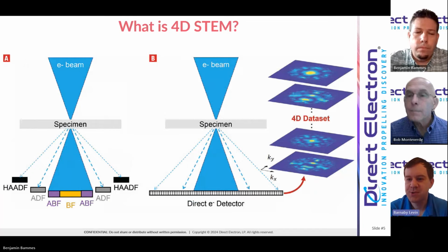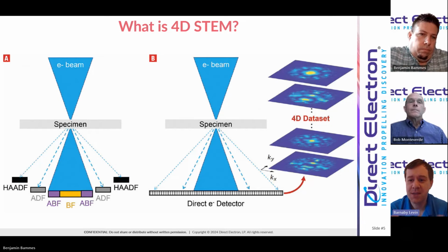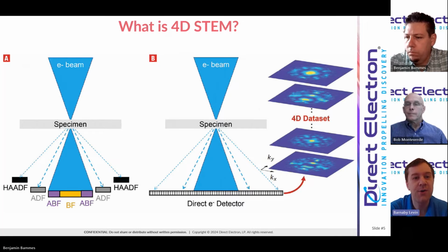So first, I'm just going to give a quick overview of what 4D STEM is. I think most of the people who've joined the webinar probably have some idea already, but I'd like to make sure everybody's on the same page. So what you're seeing here are two diagrams, one showing the setup for conventional STEM, and the other showing the setup for 4D STEM.